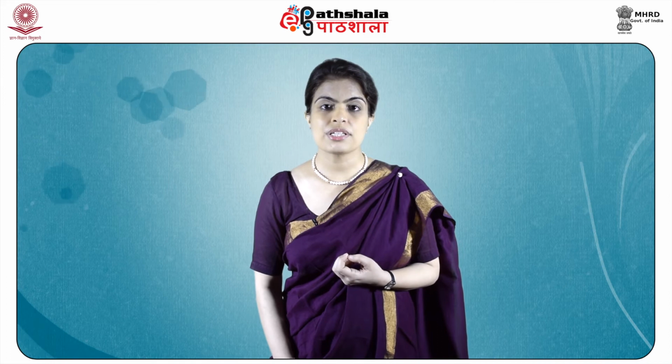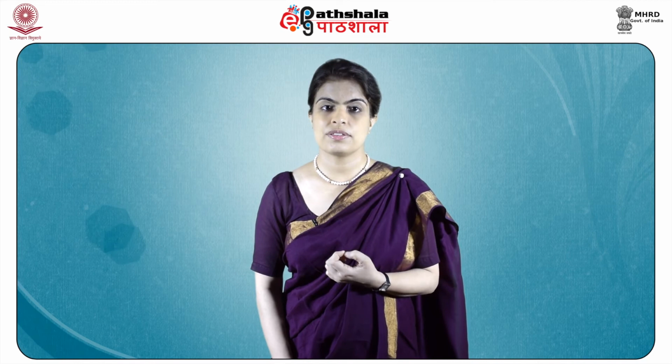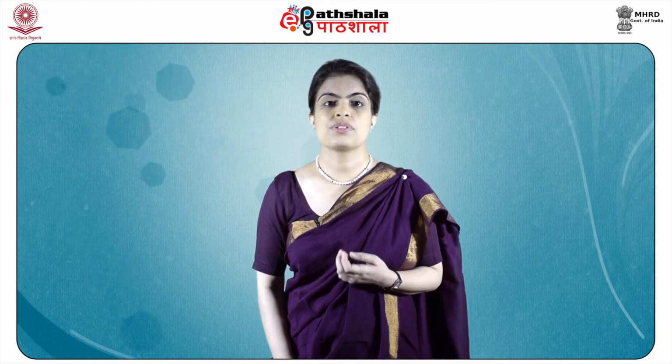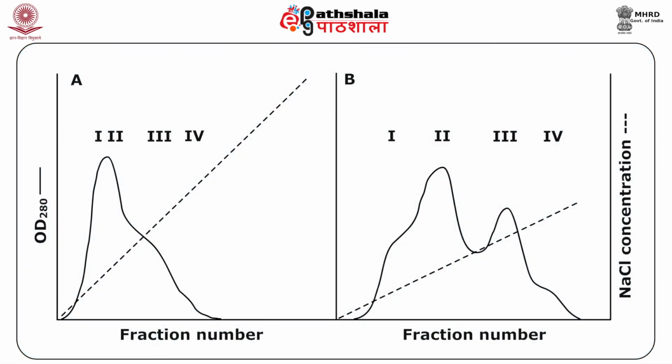Two methods are employed when eluting an ion exchange column: a continuous ionic strength gradient elution or a stepwise elution. Selection of either method is specific to the situation in question and is usually arrived at by trial and error. The figure on your screen will show the difference in resolution observed when using a steep versus a shallow salt elution. Notice how the resolution is considerably improved when a shallow NaCl gradient is used for eluting the column versus a steep NaCl gradient.